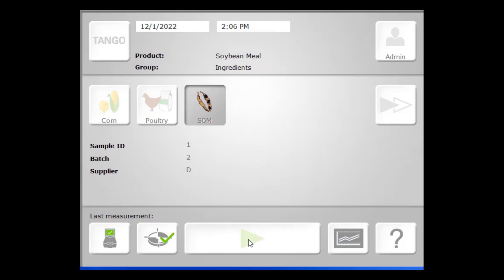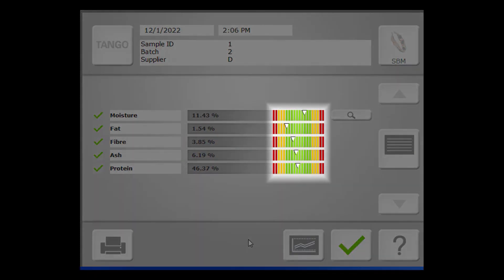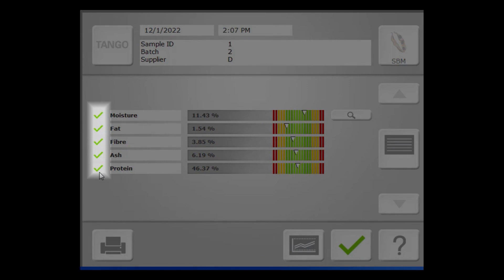After about 45 seconds, we're presented with the evaluation results. This screen provides you with both numerical values as well as visual indicators of where your results lie. In your setup screen, you're able to define limits: red depicts what's out of tolerance, yellow represents your cautionary limits, and green indicates what is acceptable. These visual indicators signal to your operators what qualifies as a good sample versus a sample that may need to be sent off for wet chemistry. The green check mark to the left of each constituent indicates that the measurement falls within the concentration range of each analysis, as well as within certain statistical thresholds based on the analyses being performed.